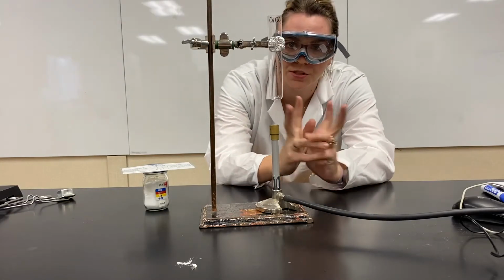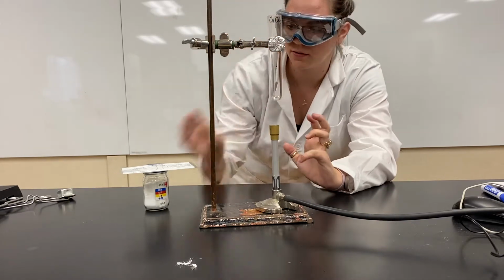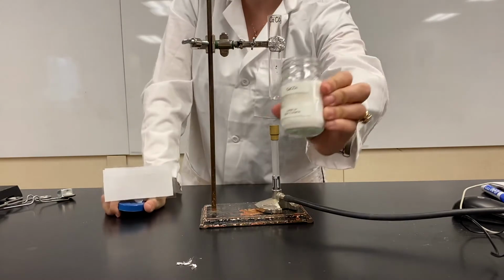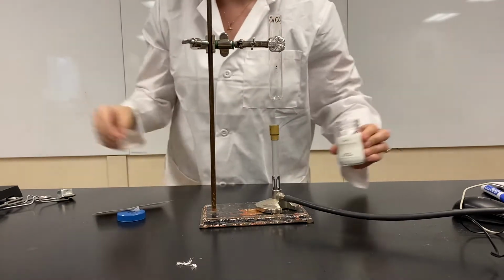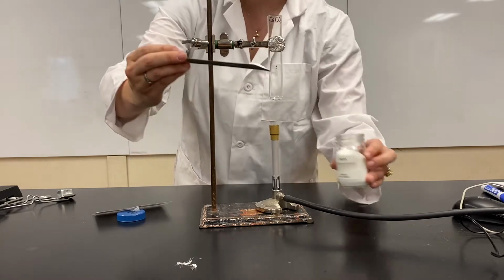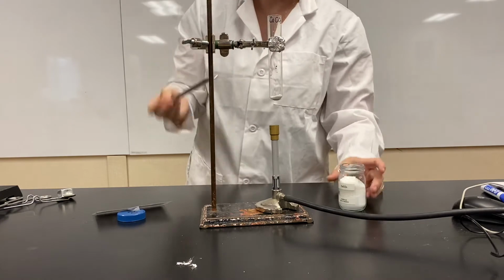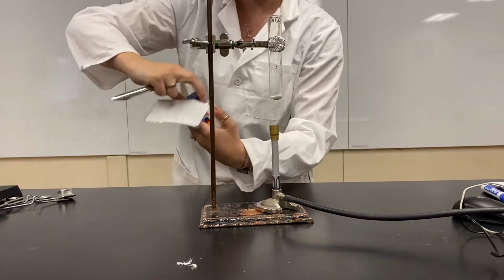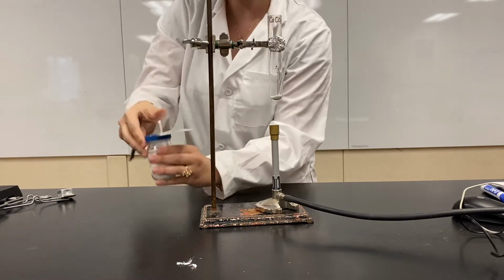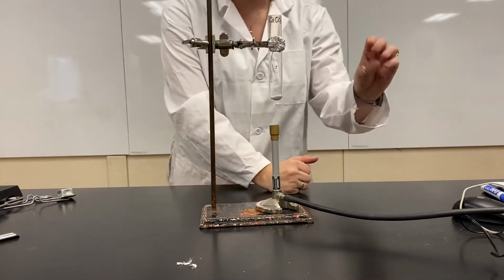On to demo number 2. We are looking at calcium carbonate decomposing. Okay, so what we do is we take some calcium carbonate. I'm gonna take a nice little scoop of it, put it into our test tube here. And then we're gonna decompose it. So in order for it to break down, we're gonna break it down with some heat.